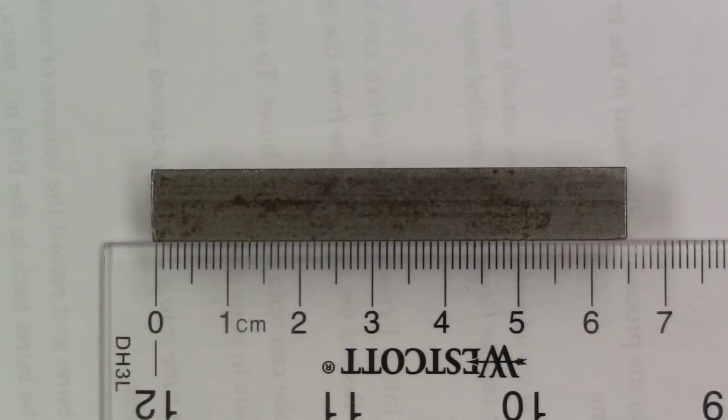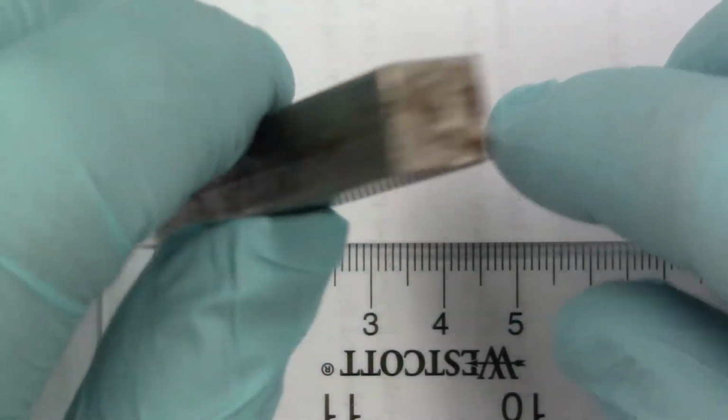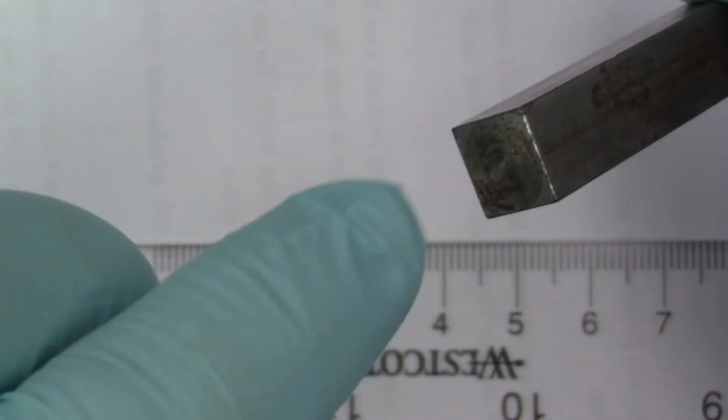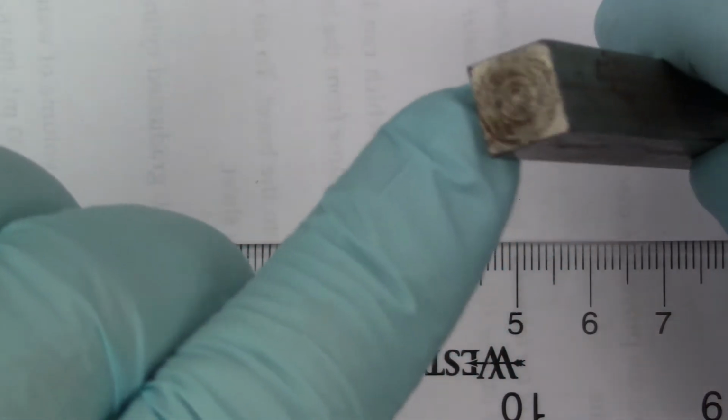Part 3, measuring volume of solid objects. Now we're going to do the direct measurement of a uniformly shaped object. So here we have a rectangular object that has length, width, and height. So this will be the length. This could be the width right here, and the height could be right on the side. Now the width and the height, I think we will agree, look about the same.